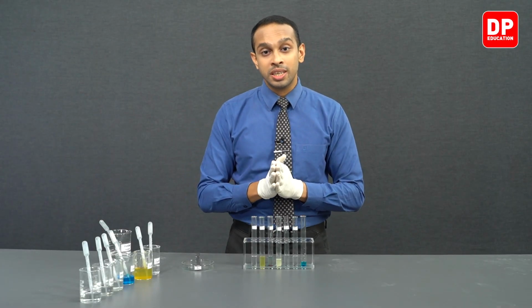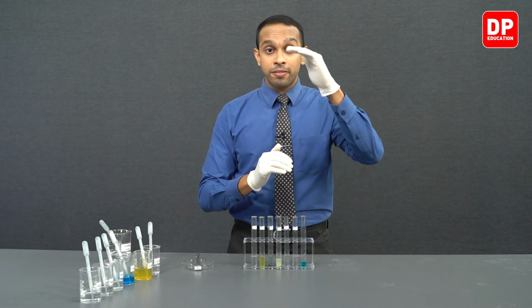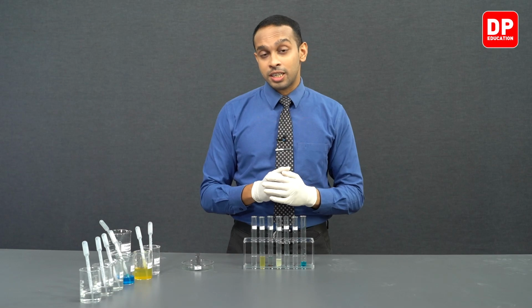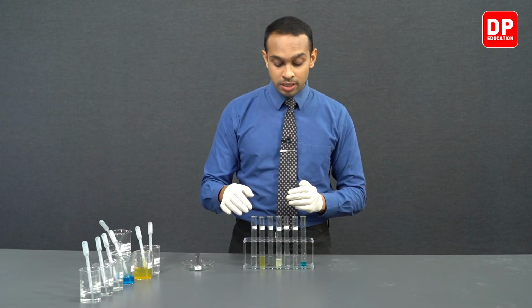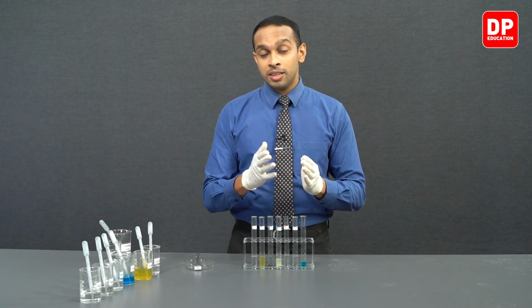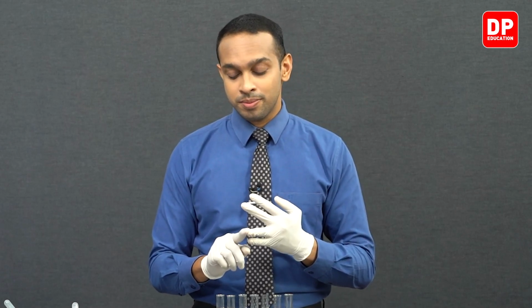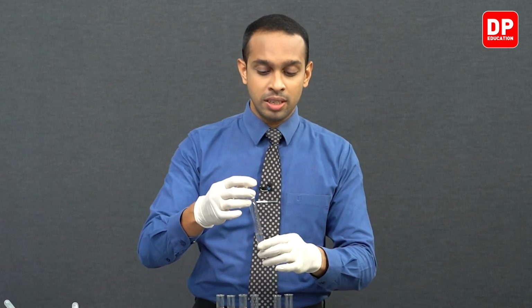So this would indicate that iron is found above lead in the reactivity series. And in the previous situation where copper 2 plus reacted with iron, this reaction indicated that iron is found above copper in the reactivity series. So iron is more reactive than copper and lead. The other solutions did not show a reaction, so we will observe that here.